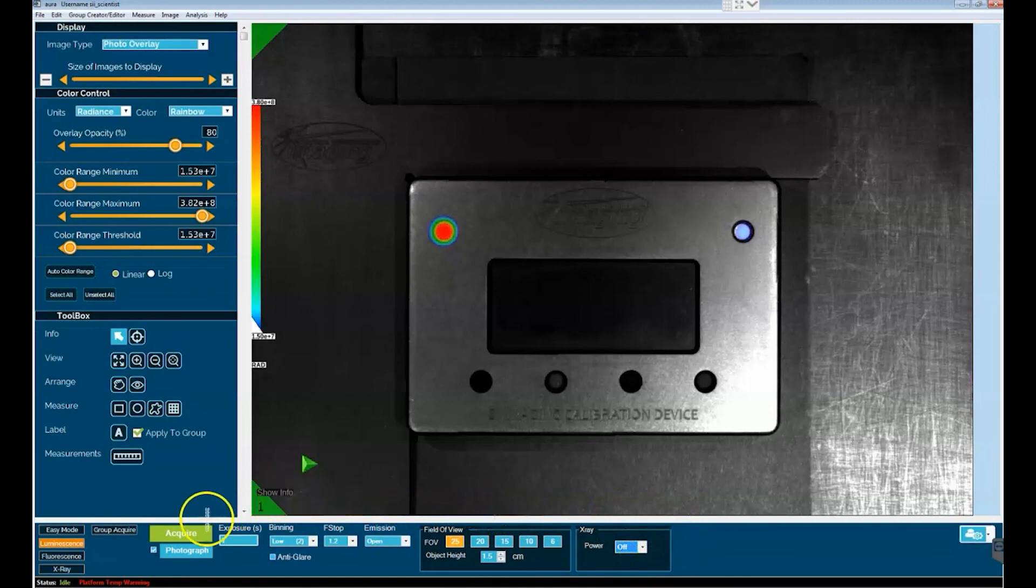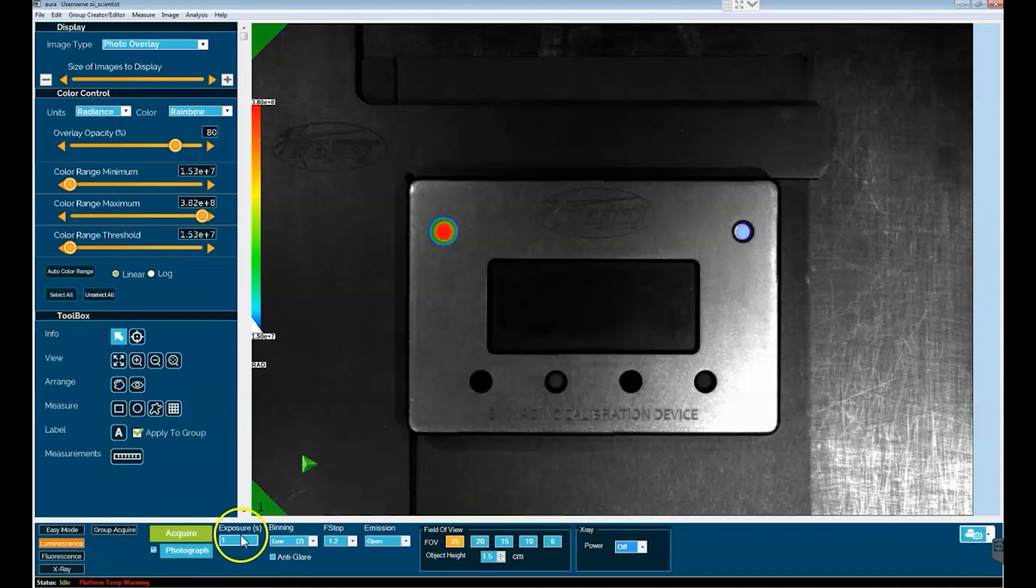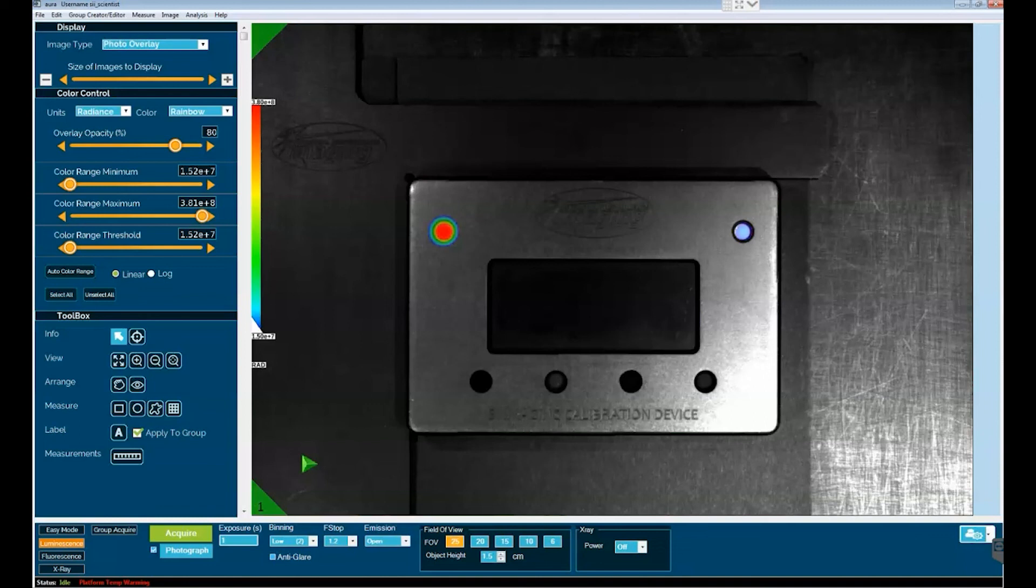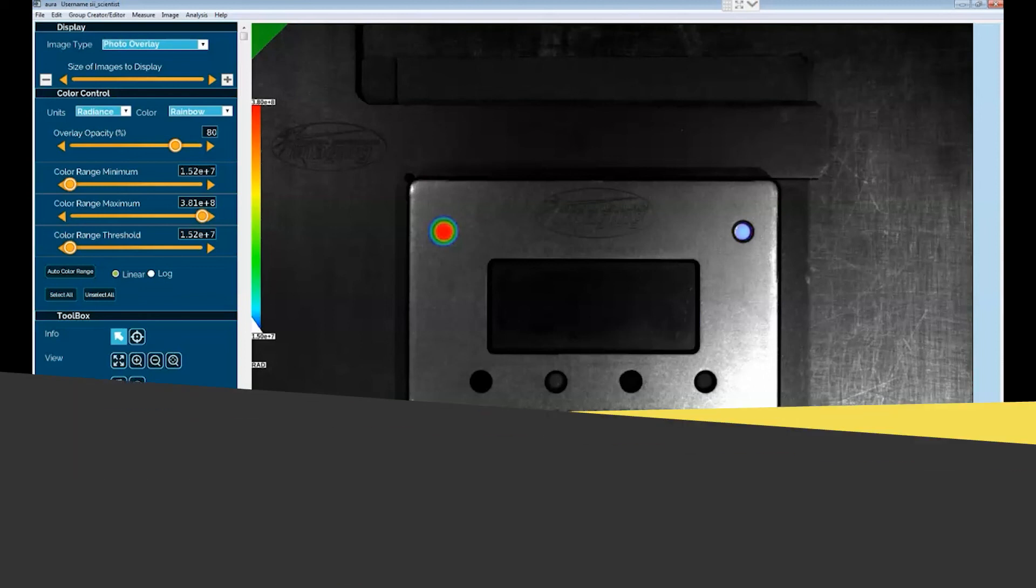That is a brief summary of the luminescent camera ribbon and the individual settings and the options for values of each setting that are available to you. You now know how to do luminescent imaging on a SI imaging device. In this particular case we used an AMY HTX system, but you could readily apply the same approach on a Logo or Kino system from SI Imaging.